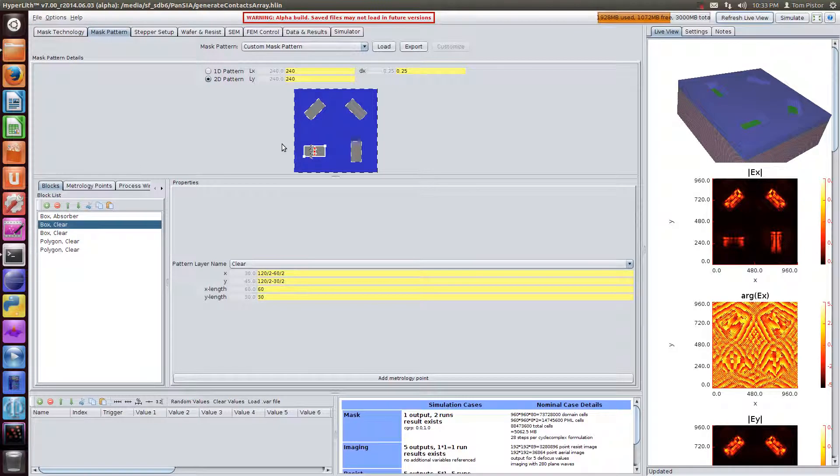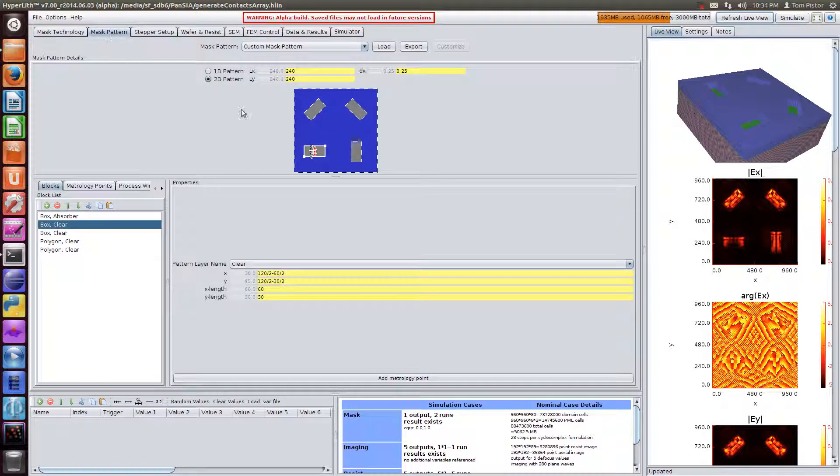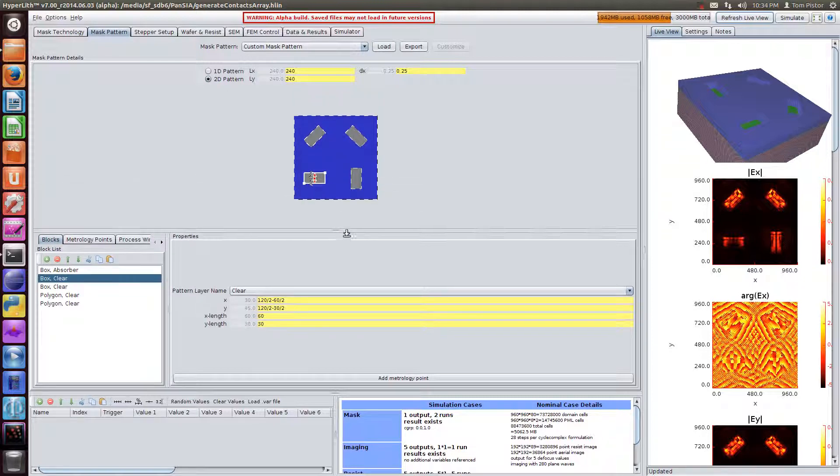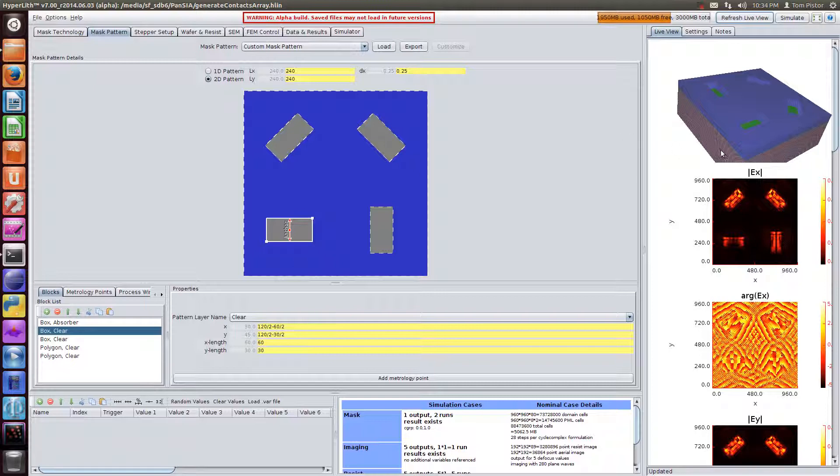In this video, we're going to do some SEM image analysis on this pattern here. This is an EUV rigorous mask model using the Trigg simulator. This pattern is 240 nanometers by 240 nanometers, and it has oblong contacts in four different directions. I'm going to show the new ellipse fitting feature of the SEM image analyzer.